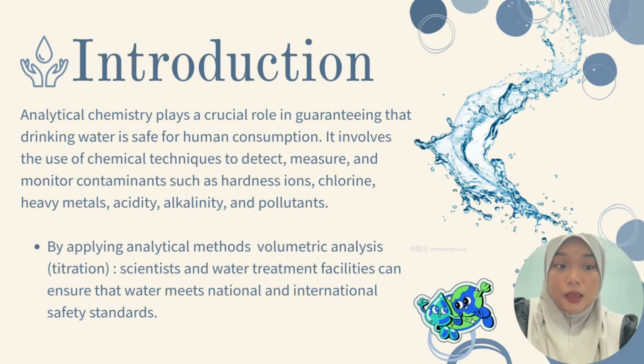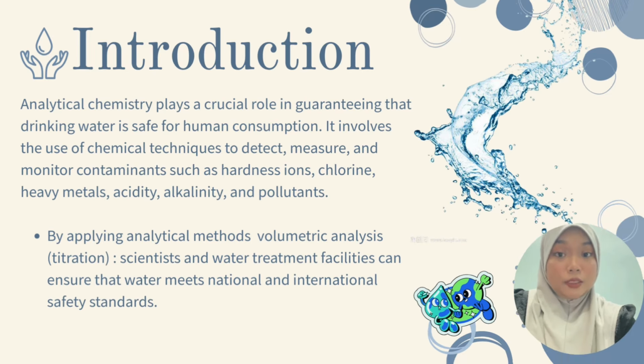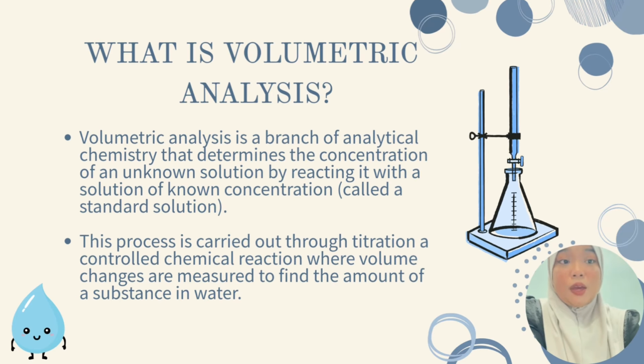By applying analytical methods, such as volumetric analysis, we make good use of titration. Scientists and water treatment facilities can ensure that water meets national and international safety standards. Next, we have what is volumetric analysis.